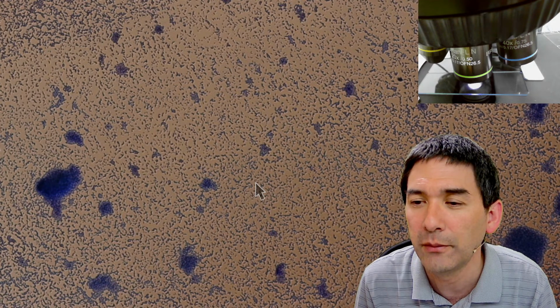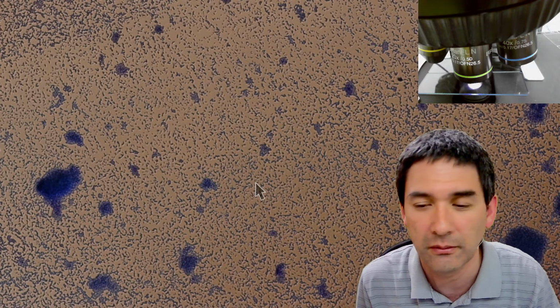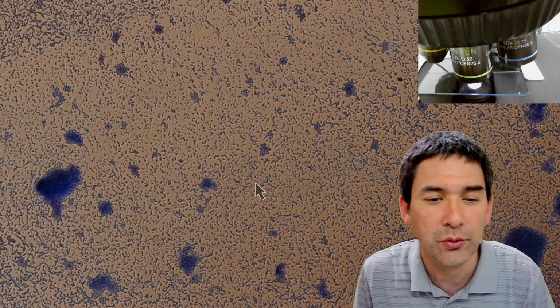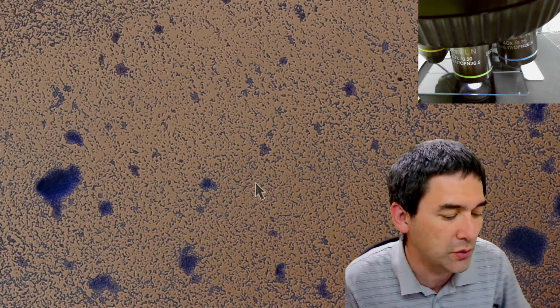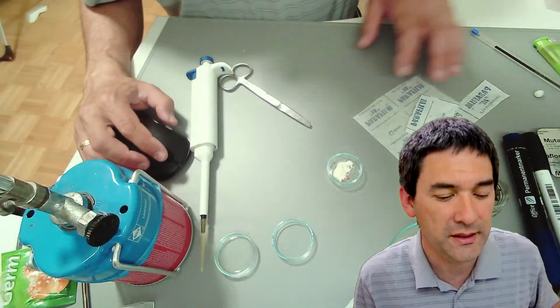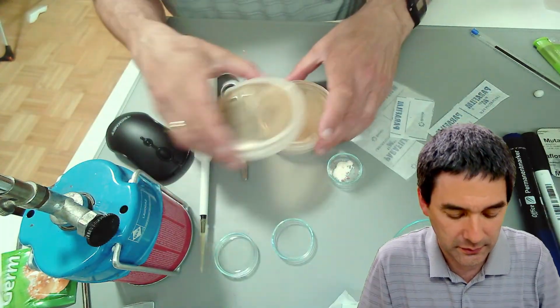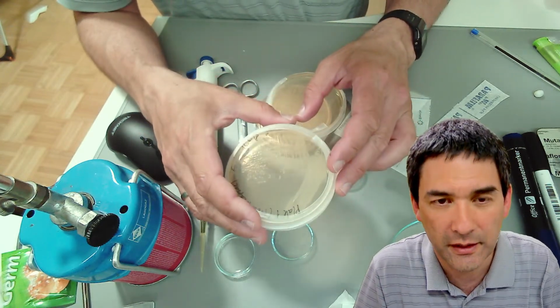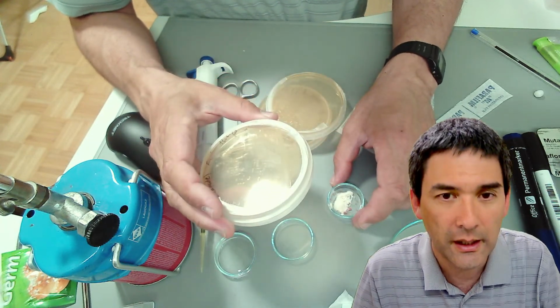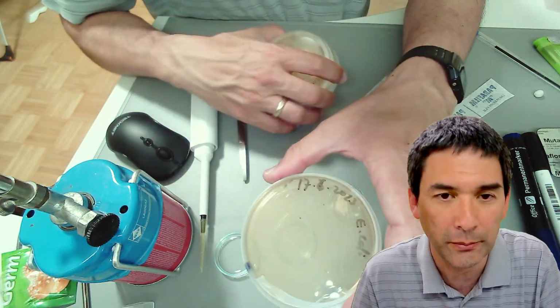So I think I'm pretty much through with all of the questions, and I've been live online for almost 1.5 hours now. If you joined a little bit late, I just wanted to give you a short summary of what I've done. I've been growing bacteria from a freeze-dried culture, and I showed you how to prepare and how to streak them on a plate.